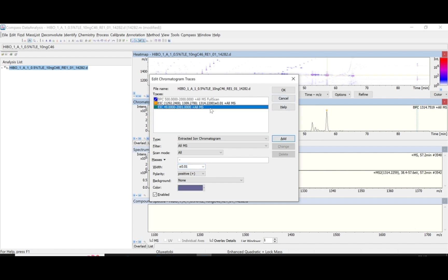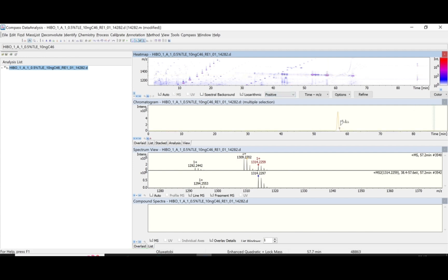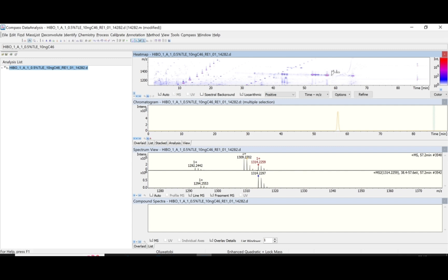I accidentally added one mass three times, so I click on it and click Delete, leaving just the correct entries. After clicking OK, it takes a while to load. We observe a change — you can see there's a change in color. It confirms the same retention time between 56 and 58, and the same mass list.